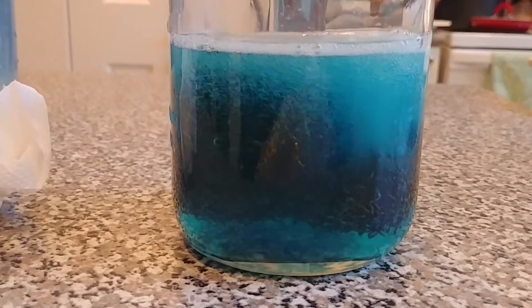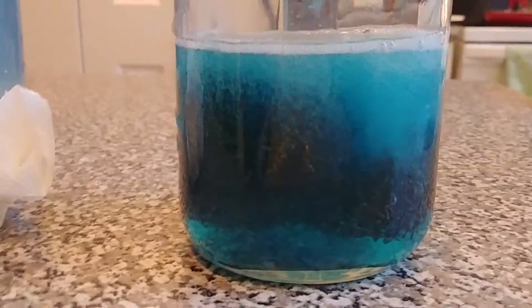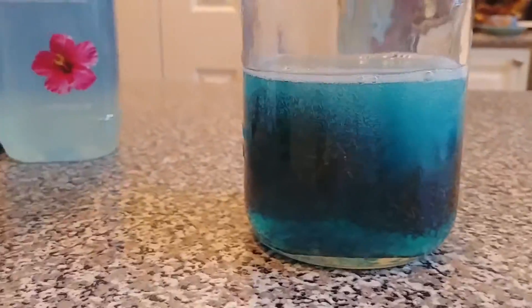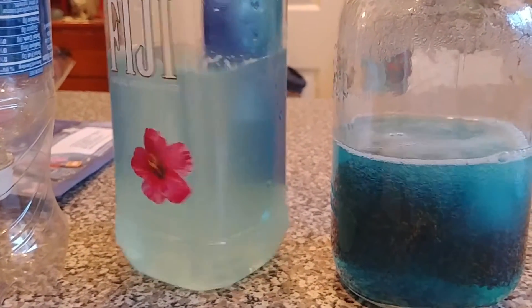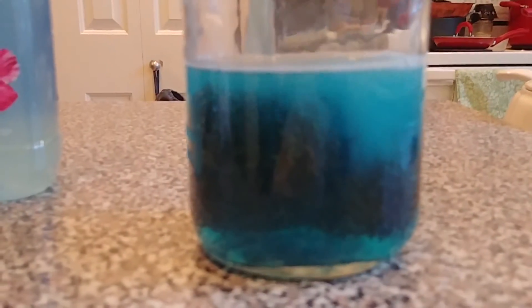This is a lot better than my first batch that I screwed up, which is right here. It's a little bit cloudy from experimenting the other day, but this is definitely a much better result.